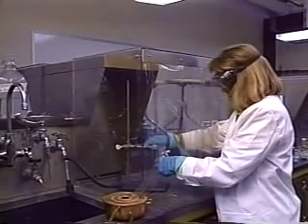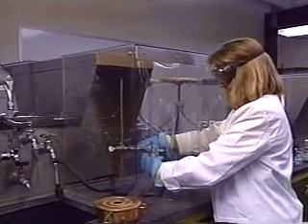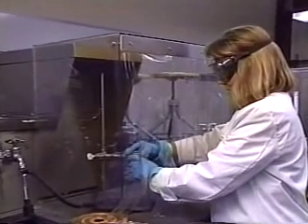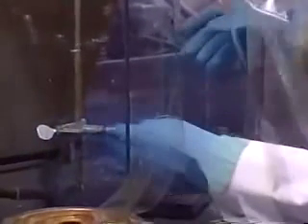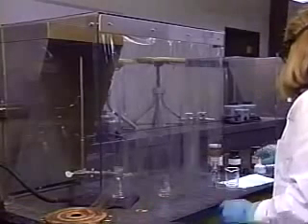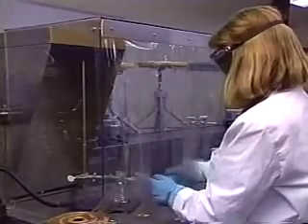Clamp your sidearm flask to a ring stand. Connect your Buchner funnel to the sidearm flask using a cork or rubber adapter.